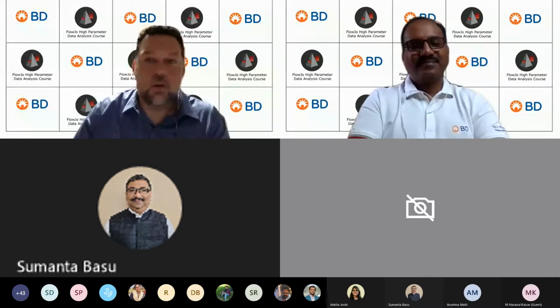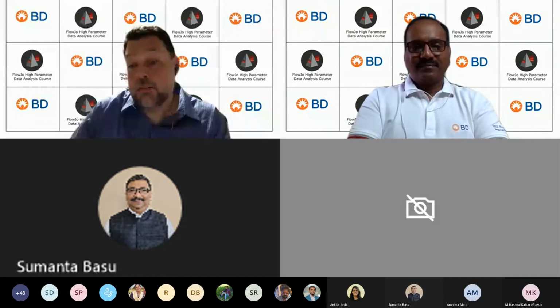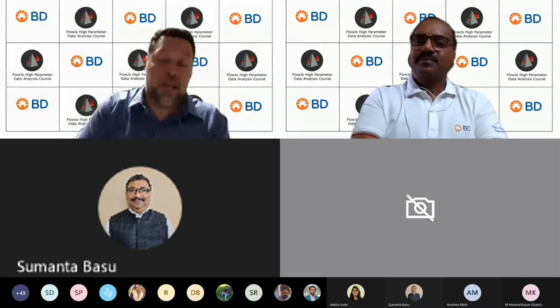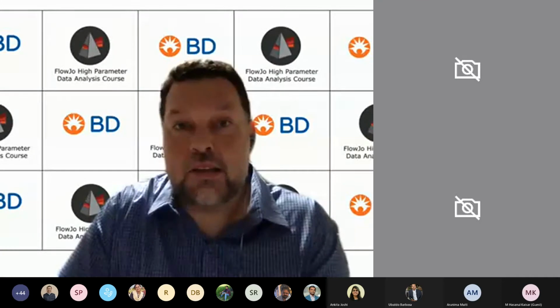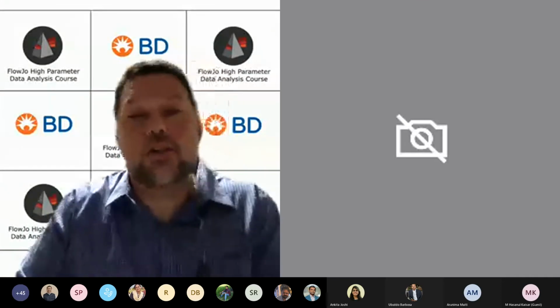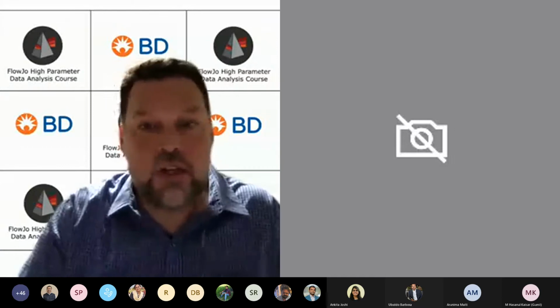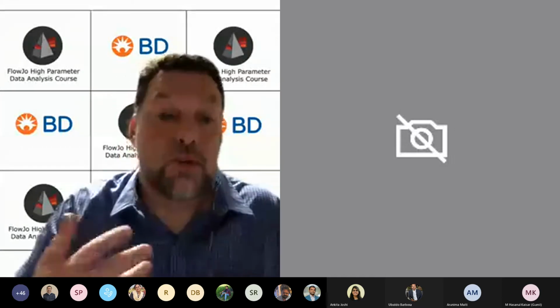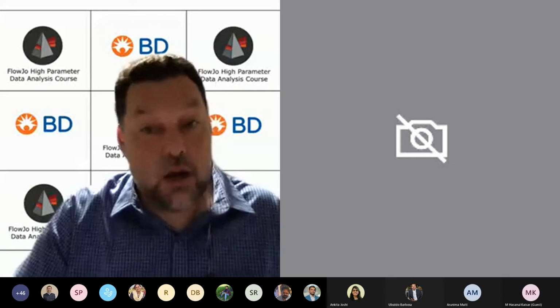Today, we're going to cover a whole bunch of different topics within the FlowJo platform to enable you to do all of the basic and then the high parameter analysis for your studies. As Ubaldo said, we're going to start with an intro to FlowJo course that I like to use to set the groundwork so that you understand all the different areas of the program that we're going to employ for our more complex workflows. And then we'll talk about compensation.